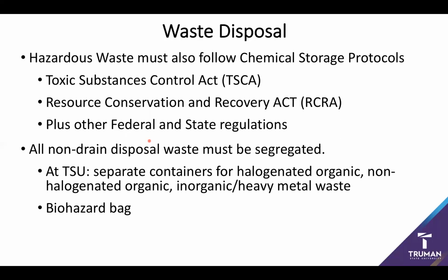So some of the classic separations are going to be keeping your halogenated organics away from everything else, because as we saw before, halogenated organics will tend to interact a little bit too heavily with some plastics and often need to be disposed of in a very different way than non-halogenated organics. A lot of non-halogenated organics can be disposed of by incineration. That unfortunately leads to some toxic gases when we're dealing with halogen groups.